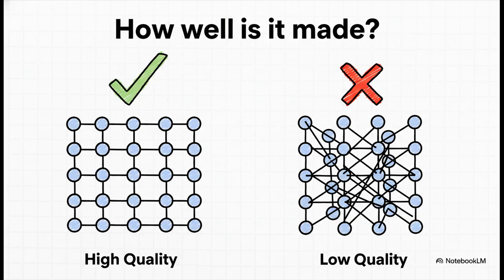Okay, so if the first scan asks, what is it? This one asks a different question. How well is it made? It's basically a quality control check for how perfect that crystal structure really is.